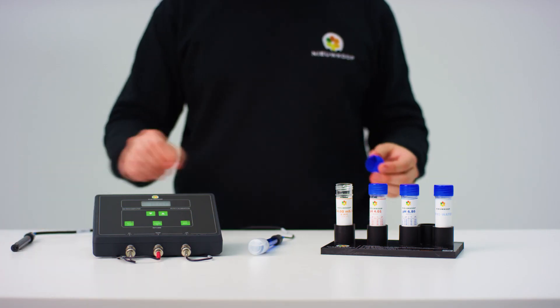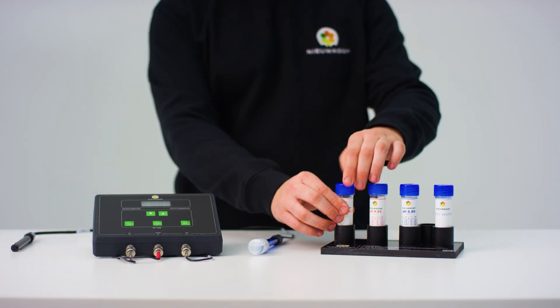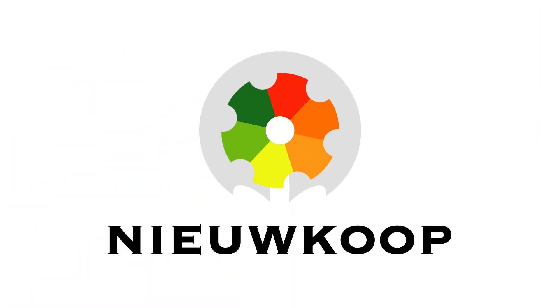The EP1400 is now calibrated and ready for use. Good luck with your project.